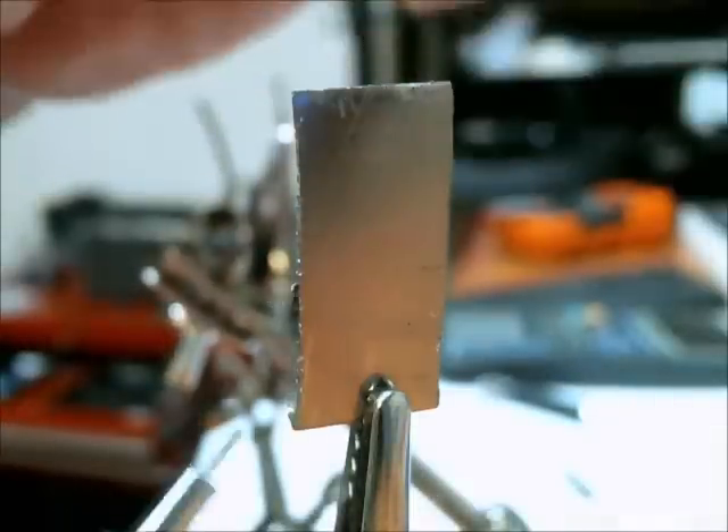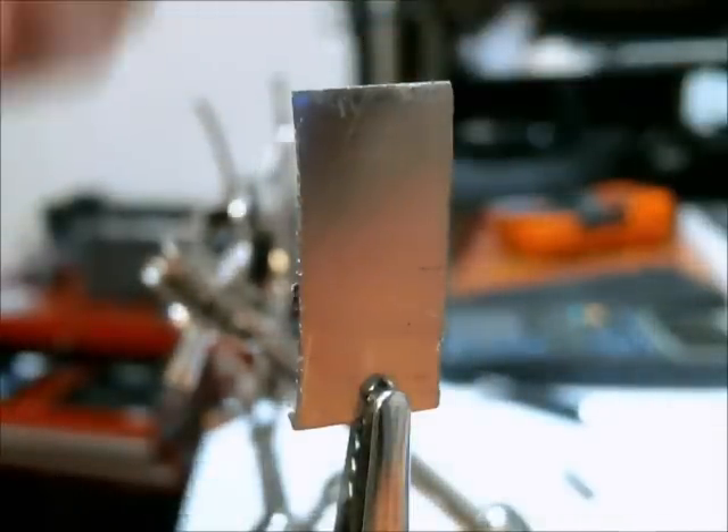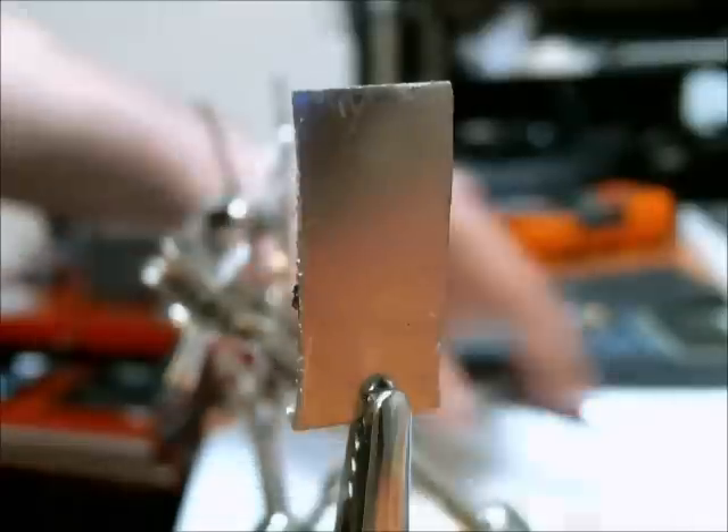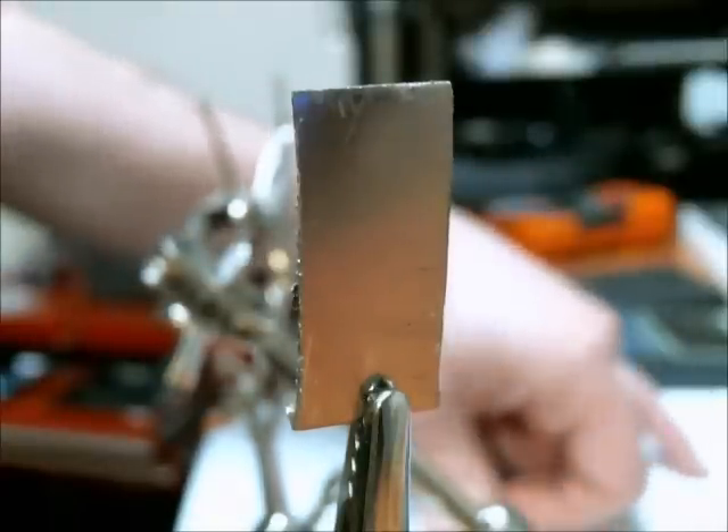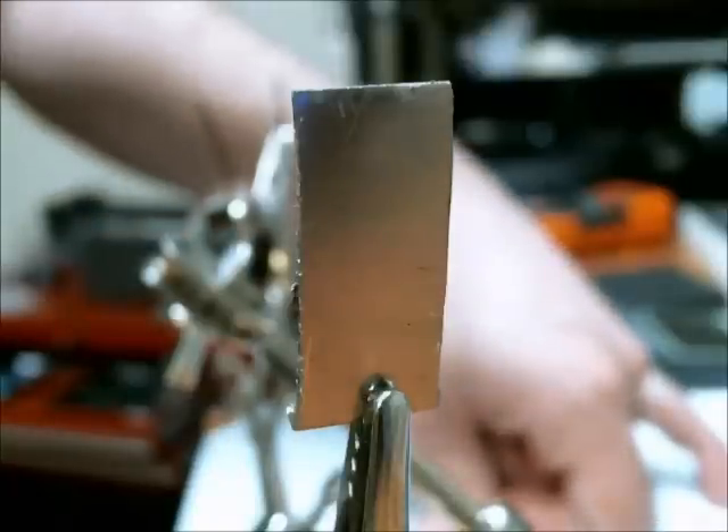Here is the nickel anode I'm going to be using. I took some measurements and the volume comes out to 156.4 cubic millimeters.